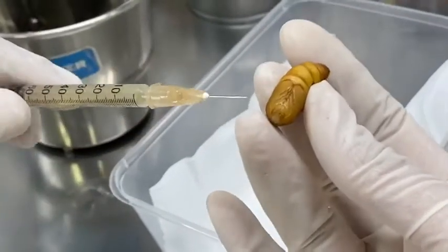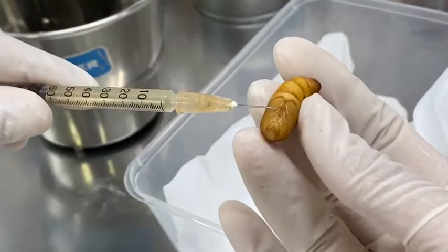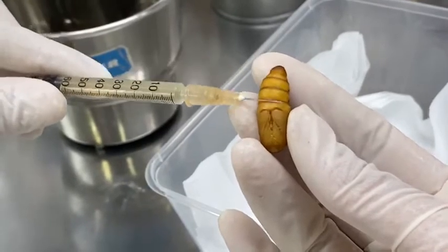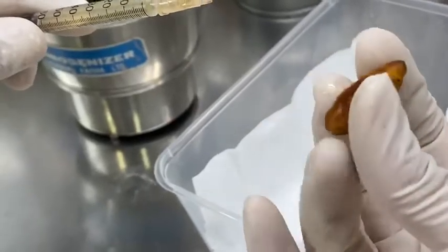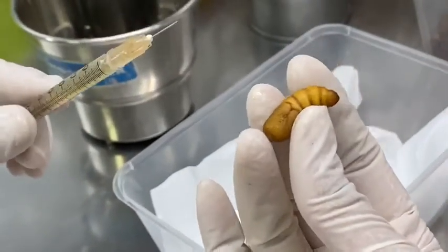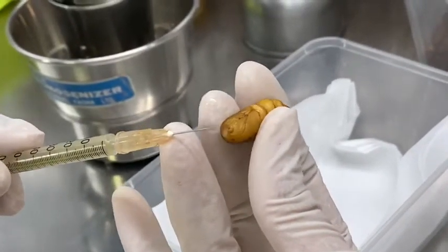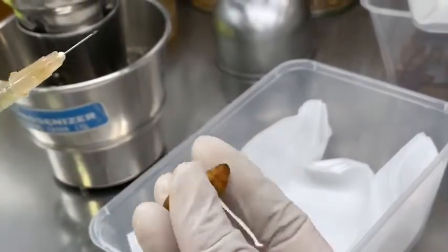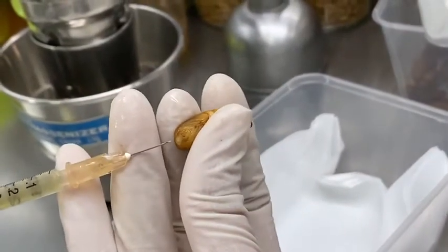There are two hard parts: one is the head and the other is the thorax. The third part is the body of the insect, which is very smooth and soft. We don't want to inject in the soft areas because if we do so we will harm the insect and kill it immediately. We want it alive, so we choose the hard points — the head between the eyes or the thorax — then we can inject.